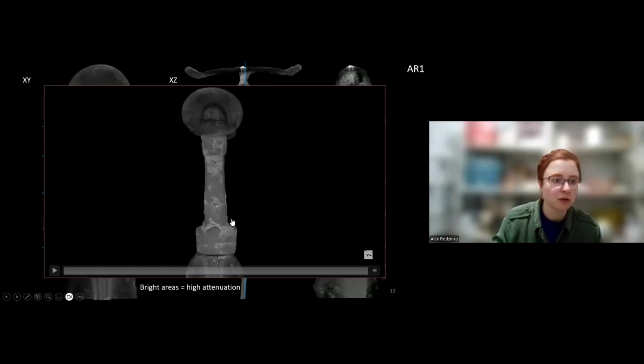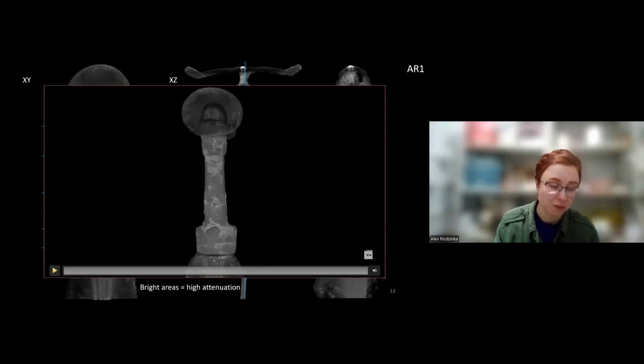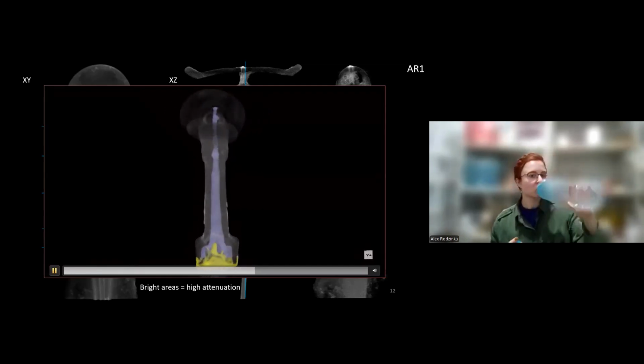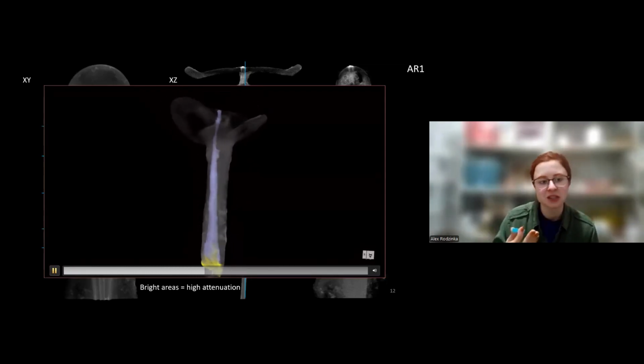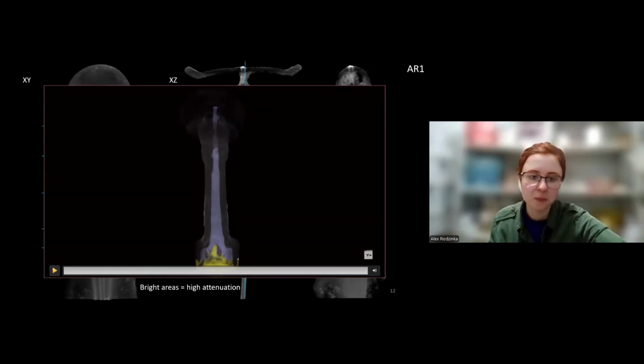And to show you what you can do with data like this, because it's one thing learning about the object you're researching, but another thing is being able to show it to people, show your results, and try for them to reach as many people as possible. So one of the things you can do with such data is cool animations like that, where you can really see that iron. You can play with different colors and everything. You can do really cool things, but this is just nice to show you in 3D how that glue works, and how that sword was cast as well.